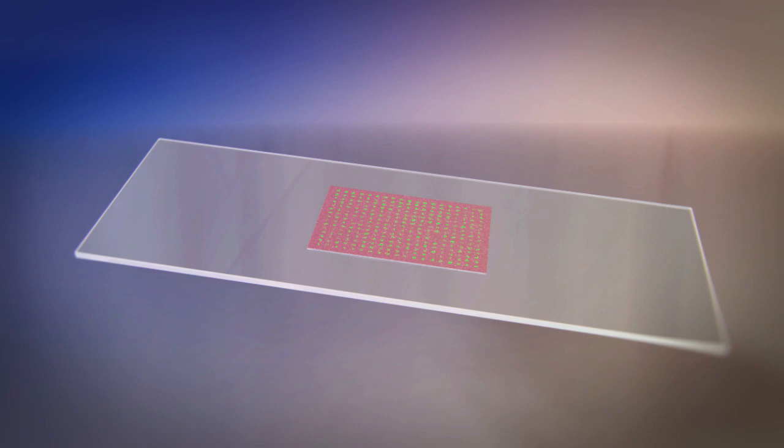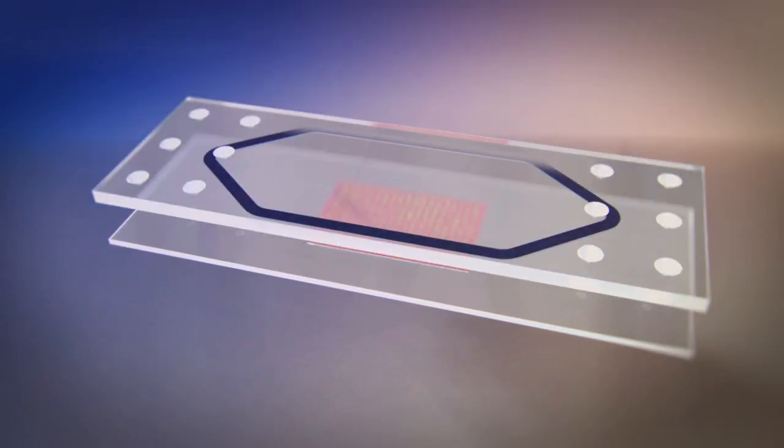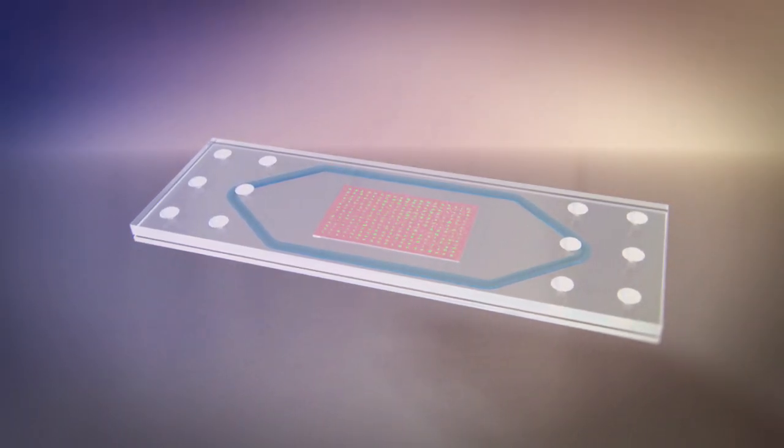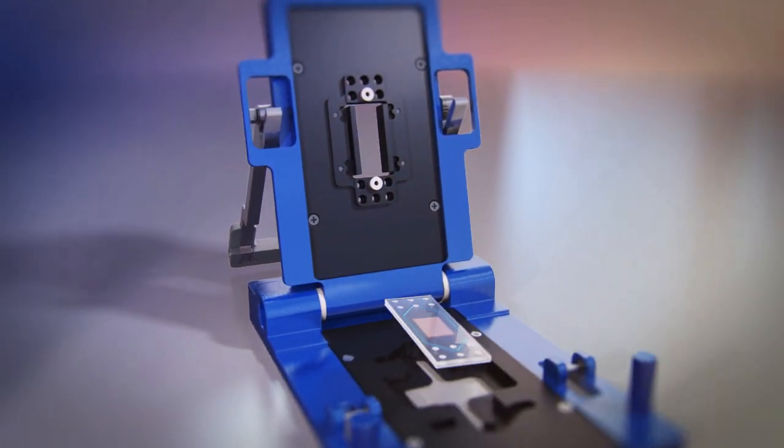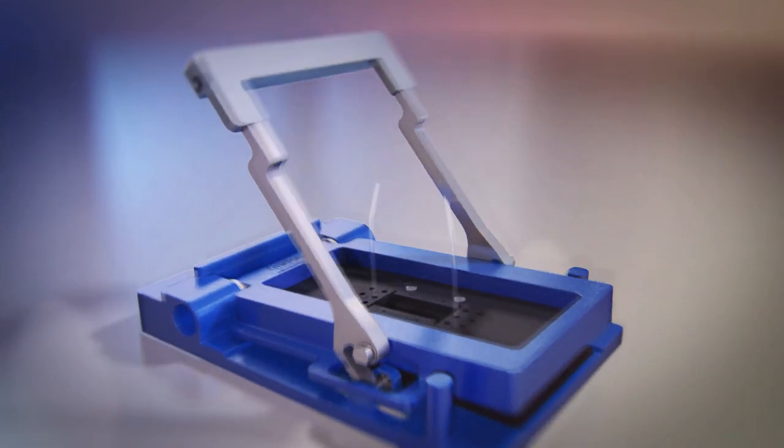First, the flow cell is assembled by placing a glass cover with a gasket on top of the cell array. This assembly is inserted into a flow cell holder. After closing the holder, a microfluidic connection is made, creating a continuous flow across the receptor cell array.